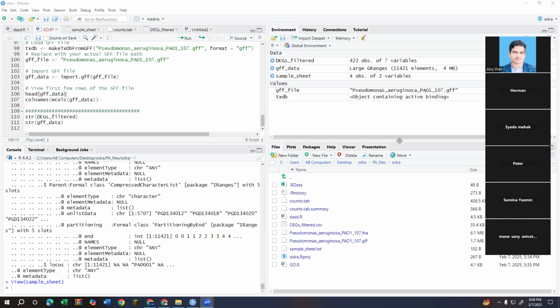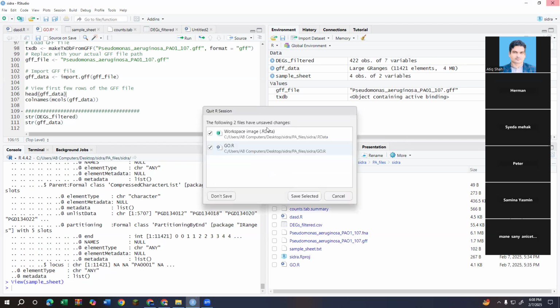Okay, I got the maximum messages, yes. So now we know we have the tools.